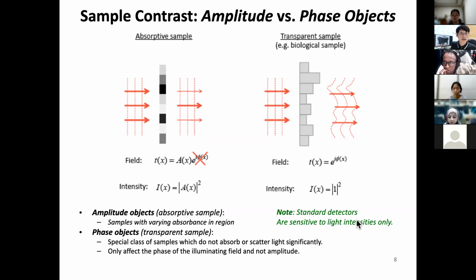Light has a property: you can convert this phase into something like intensity, for example, by the use of interference. So remember our detectors, PMT, camera, image sensor, most of these only see the intensity information, and they are also time averaging. That's what I wanted to say.